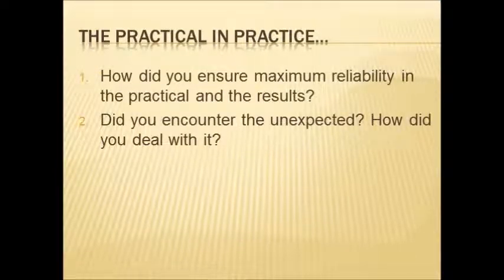The next section is about what you actually did during the practical. Did you follow the procedure without any changes, or did you ensure maximum reliability by modifying it in some way? Did you encounter the unexpected? Did something odd happen? And how did you deal with it? For instance, you might have found that the agar took a lot longer to set than you'd expected. How did you deal with that?